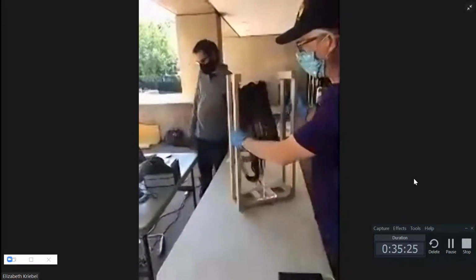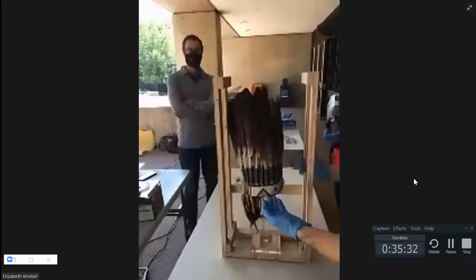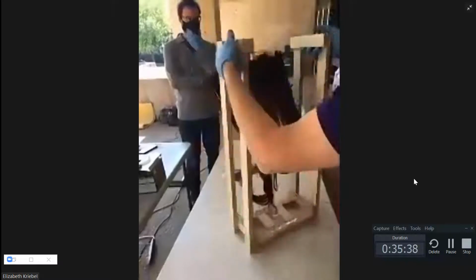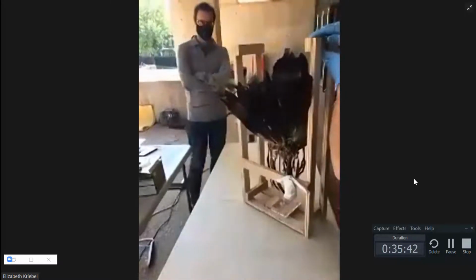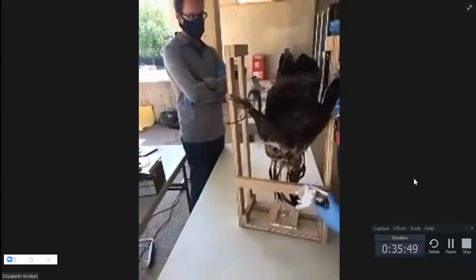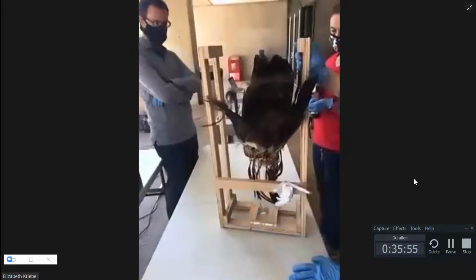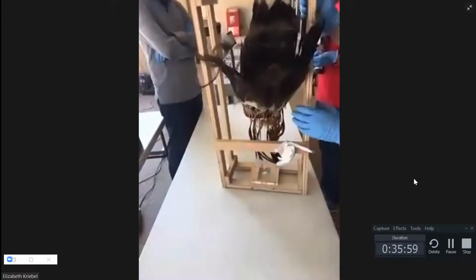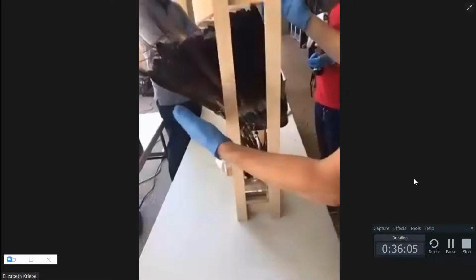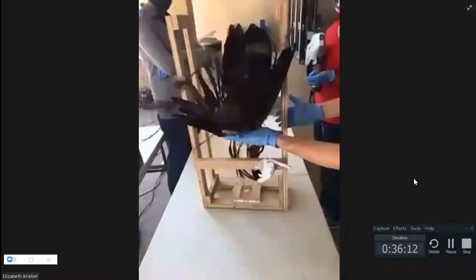We have a headdress. We don't know much about it other than possibly Sioux from the plains. You see it's beaded on the front. It's got eagle feathers, felt against felt backing. And then it's got these beautiful secondary feathers attached to the tops of the eagle feathers. On the bottom at the back, I can't tip it over for you, but you see hanging down additional horsehair or something that's all been dyed different colors. On the basis of what we know about our collections, we think there's a good chance that these feathers may contain lead and that the felt may contain arsenic.